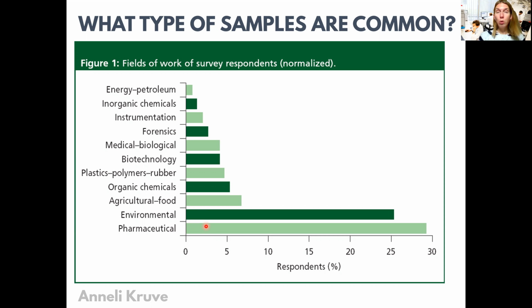It is not absolutely sure if into this category some of the responders also indicated, for example, medical samples such as drug studies from blood samples, but definitely here belong all kinds of pharmaceutical quality control and production samples. So all this kind of things could belong here.